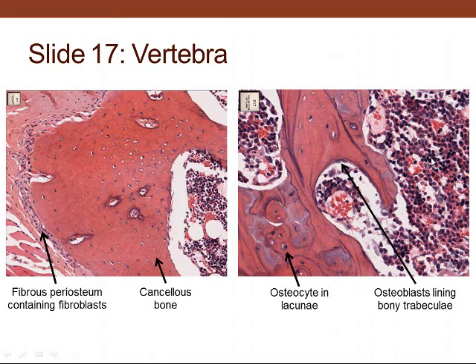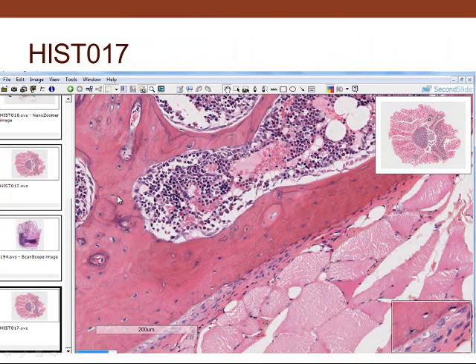You can see the blood formation, and here we see periosteum, that is fibrous connective tissue that surrounds the bone. You can see it right there, periosteum, bone. In through there, these would be osteocytes as well. And bone does not grow by interstitial growth; it only grows by appositional growth.